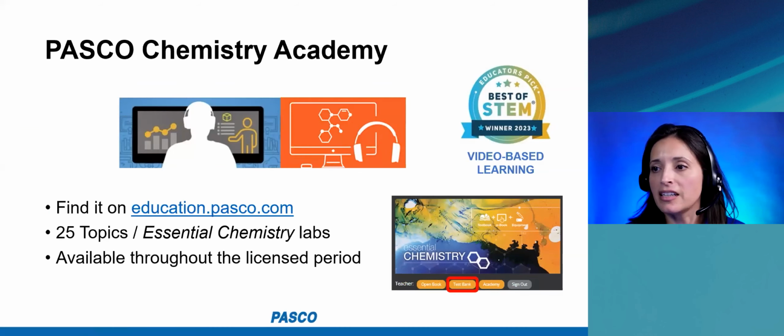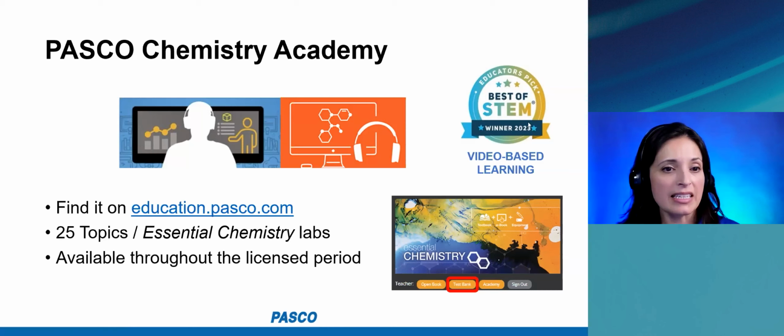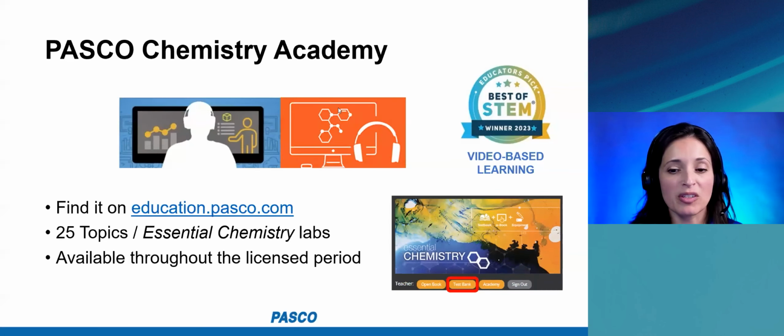Okay, so that's building tests. Heidi, are there any questions? Great, thanks. Okay, moving along to PASCO Chemistry Academy.